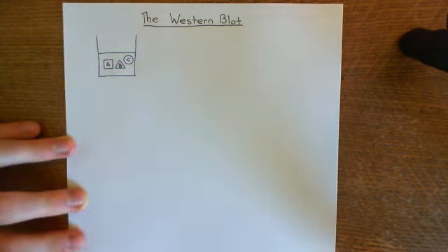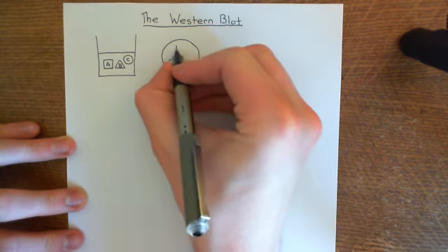You want to be able to decide whether in a mixture of proteins, a certain protein that you're interested in is present. Now, where are you generally going to get a mixture of proteins from? Well, generally you're going to get them from cells. So often the question becomes, you've got a cell here, and you want to know whether a certain protein is present within the cell.